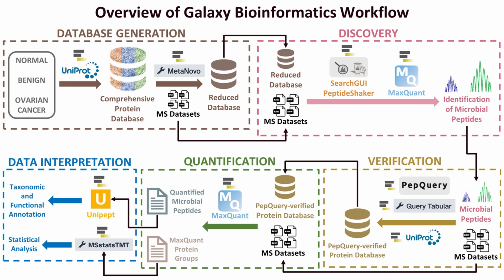Lastly, we have our data interpretation module in the bottom left corner. In this module, we will perform statistical analysis using MSStats TMT and taxonomic and functional annotation using UniPept.